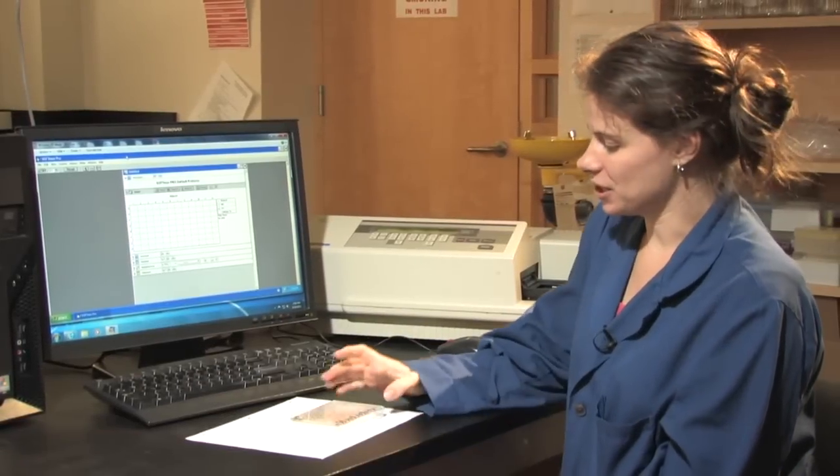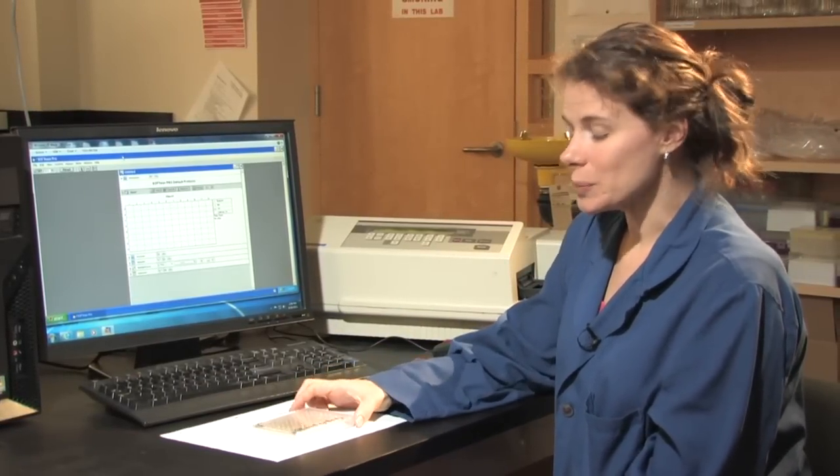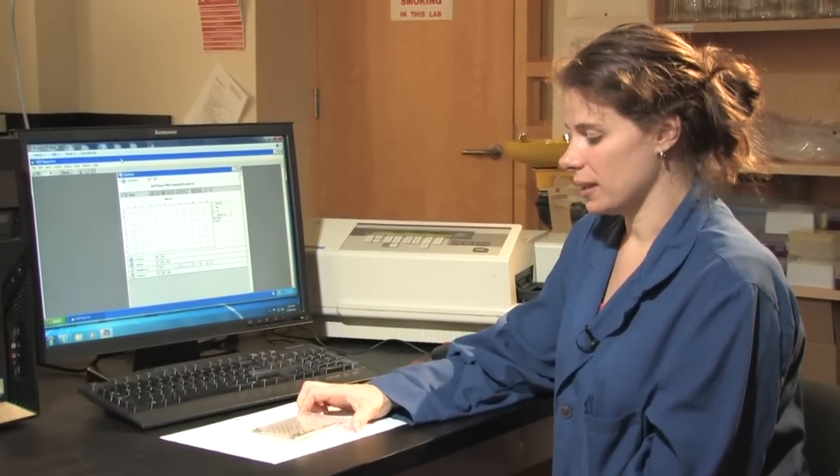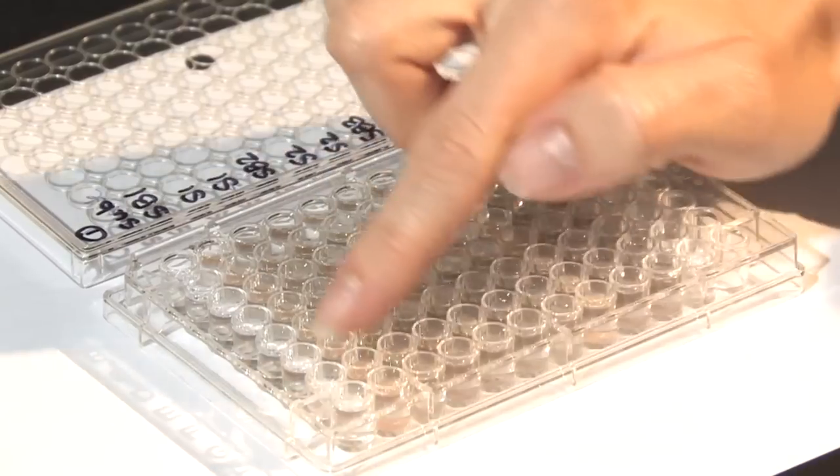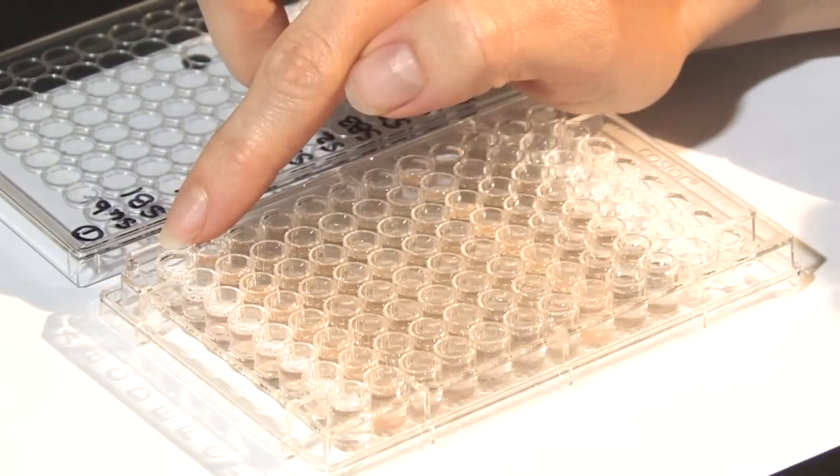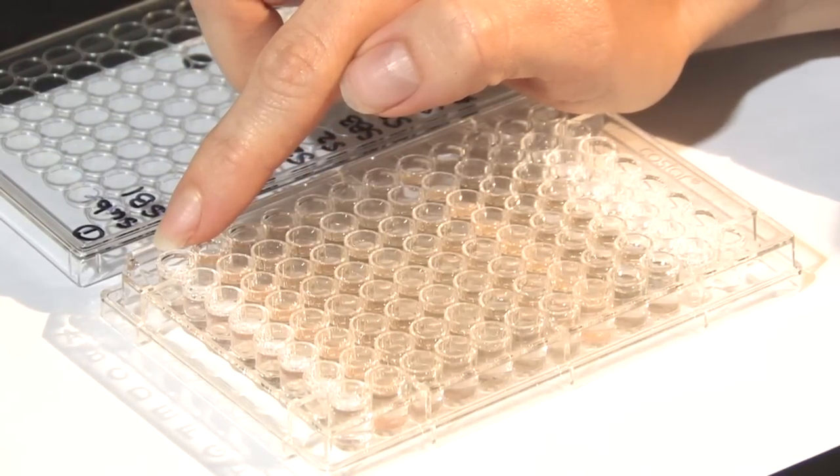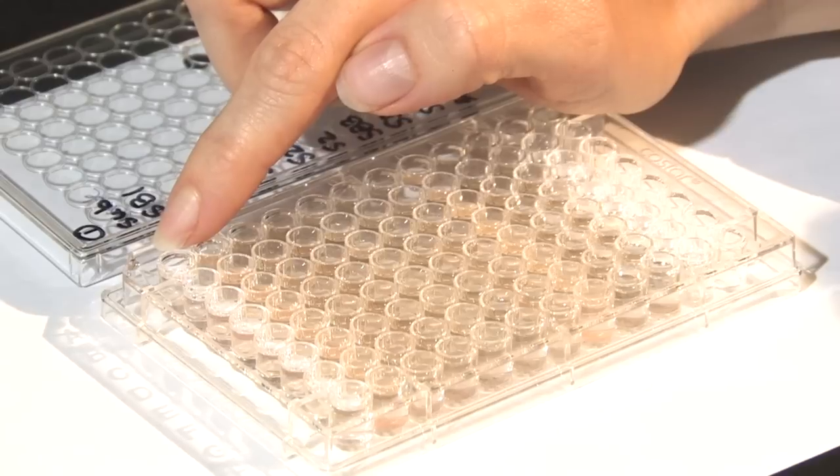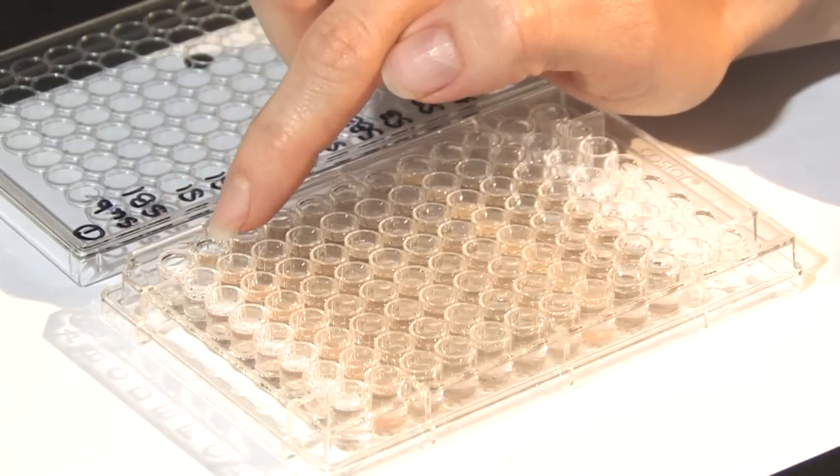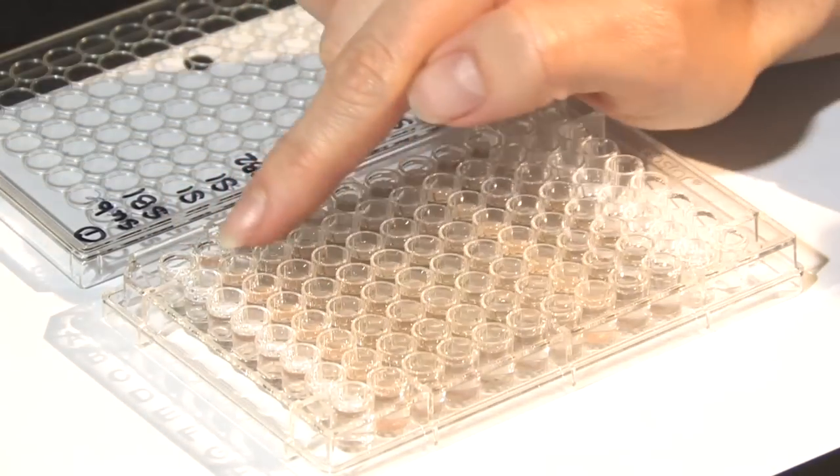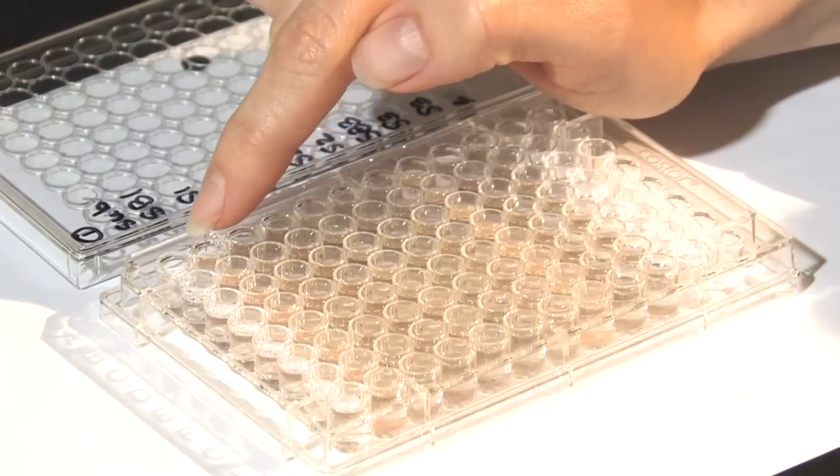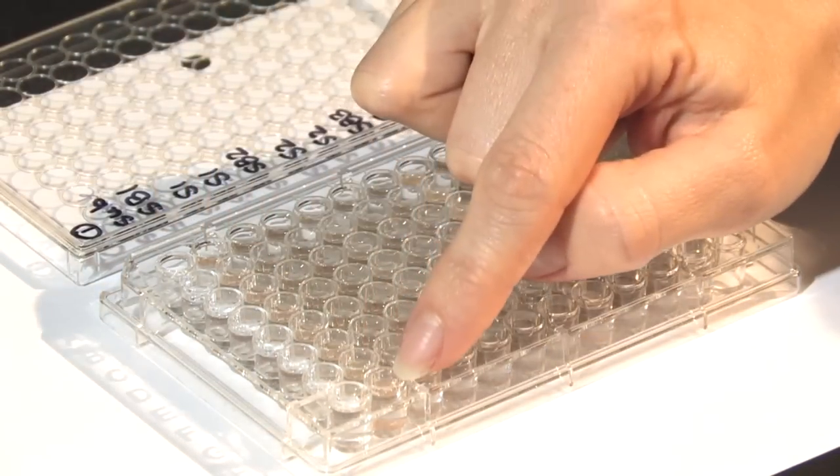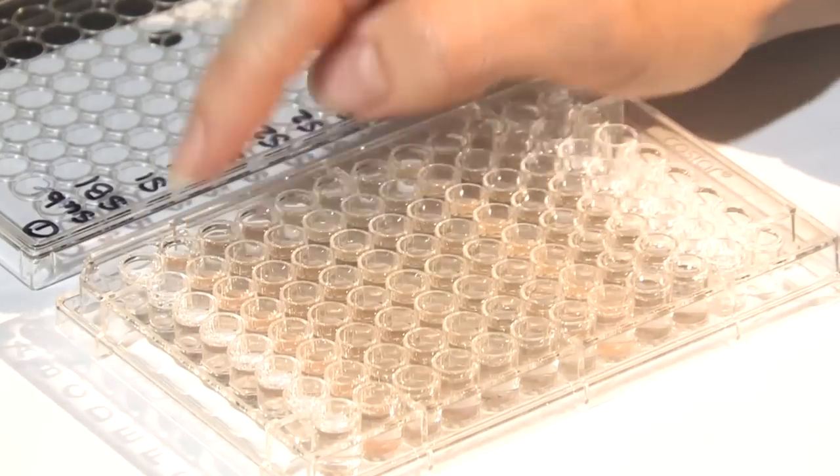After the 18 hour incubation, I have removed my DOPA plate from the dark. And you can see in the first row here, we have very clear color. This represents the DOPA with the buffer. So there's no activity or color change in that. In the next row, I have soil and buffer. And so there's a little bit of color, but the soil did have a color to it. So that's okay.